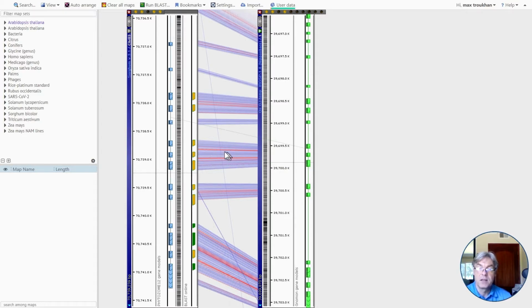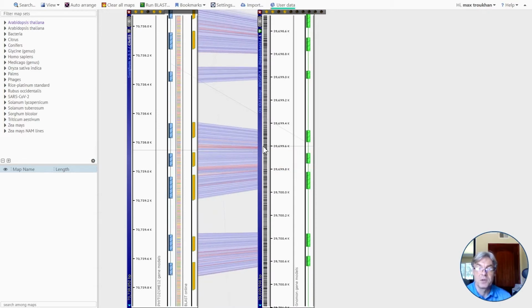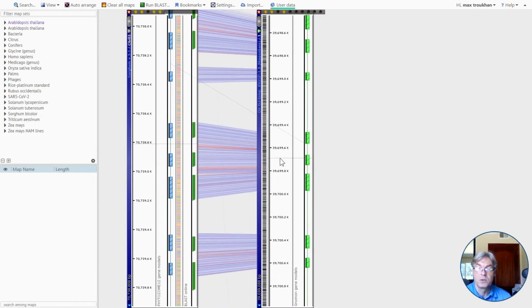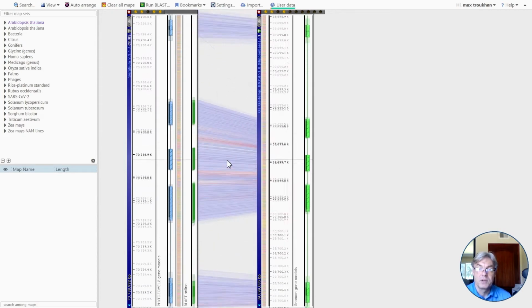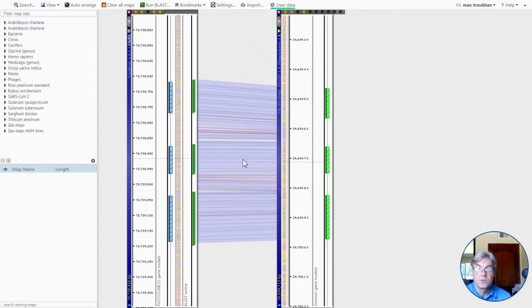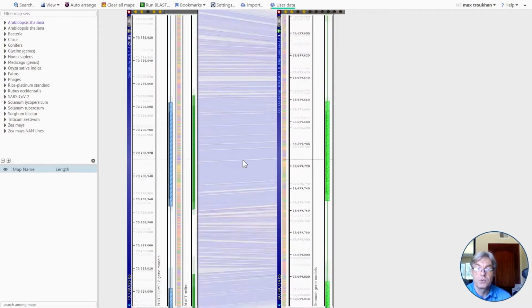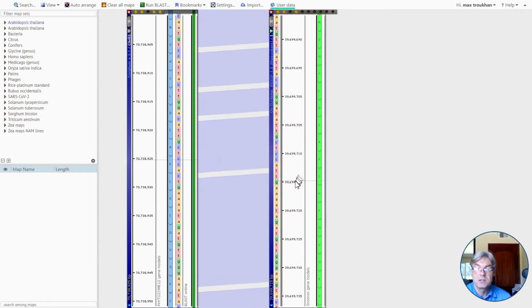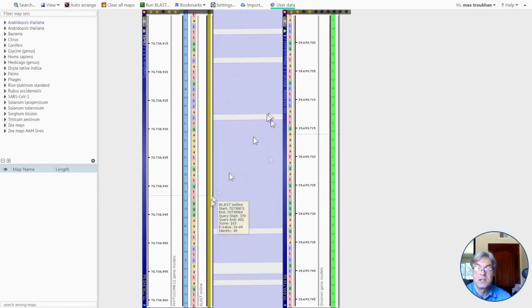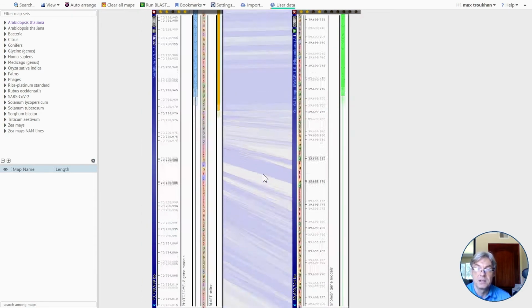Again, we will notice that there is not much conservation in introns, and these red lines correspond to indels. So again, the indels get together inside introns, but not in exons, because nature will not tolerate them inside exons. Okay, so just a quick observation by looking at the graphics. If you zoom further, you will see, yes, these are identical DNA sequences with some mismatches here, or if you look at the intron part, these are indels.